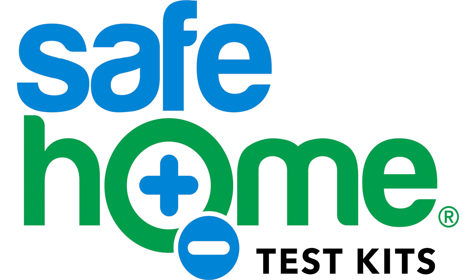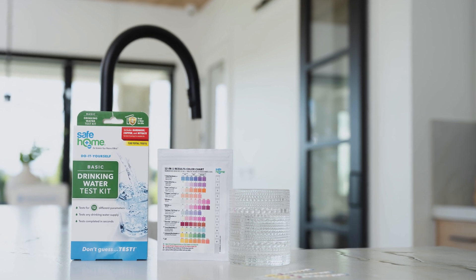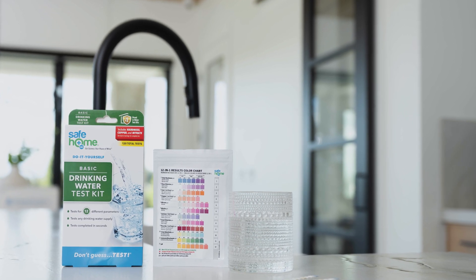In this video, I'm going to show you how to use the SafeHome 12-in-1 test strips. These test strips give you results for 12 different parameters for your drinking water, all with one test.